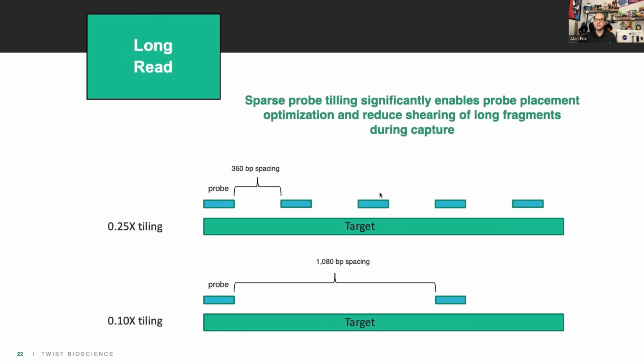The only problem is sometimes with Oxford Nanopore, the quality could be a little bit poor with the fact that our indexes are 10 base pairs on each side, dual indexes. So you have 20 base pair dual indexes, such that the 20 base pairs maybe isn't enough to really resolve each sample. So you might not want to really multiplex, depending on how you want to go about doing it. But that's something we can always talk about later if need be.